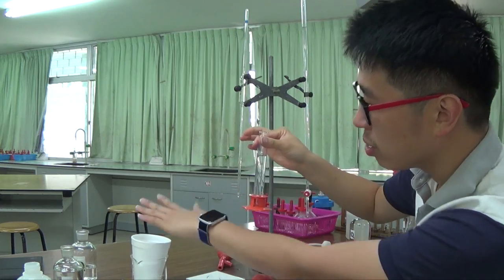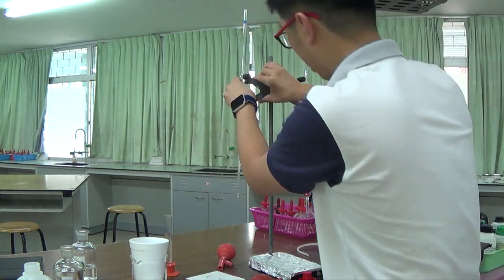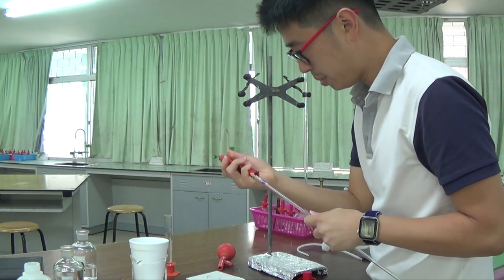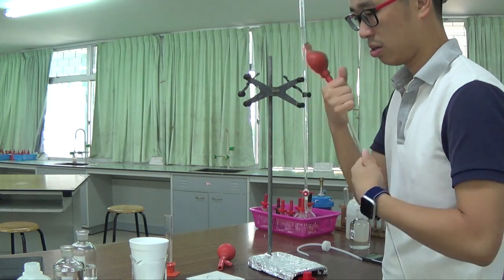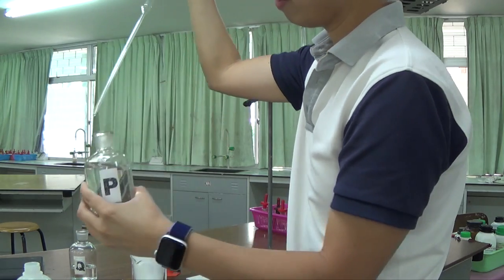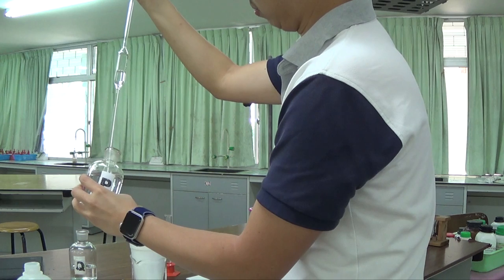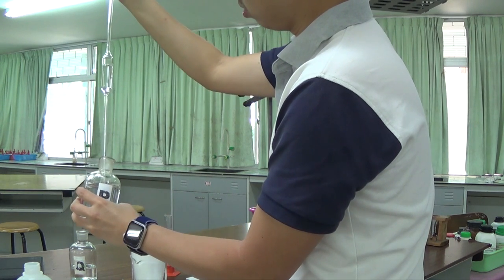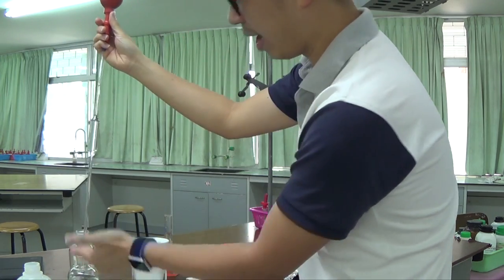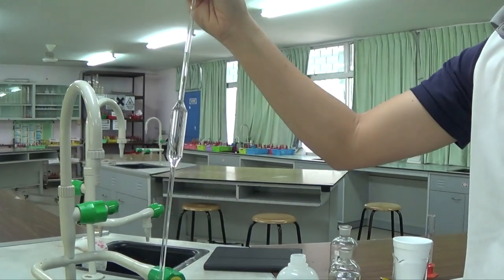We do not pour this into the cup yet, because we need to prepare our 25.0 cm cube of P. Okay? So we need another 25.0 cm cube of P. So this is P. So we always prepare a bit extra, but again, we do not ever pour it back into the flask. So what we do is, we just throw it down the sink.